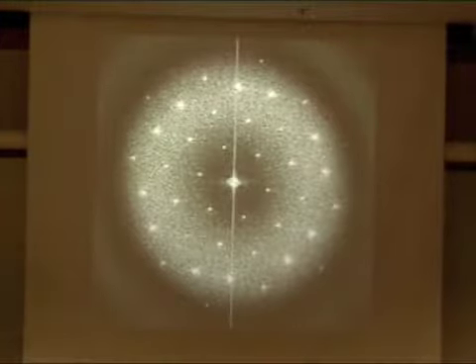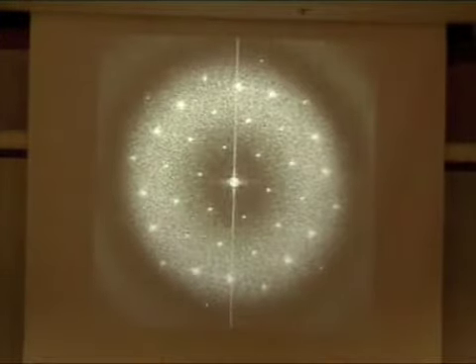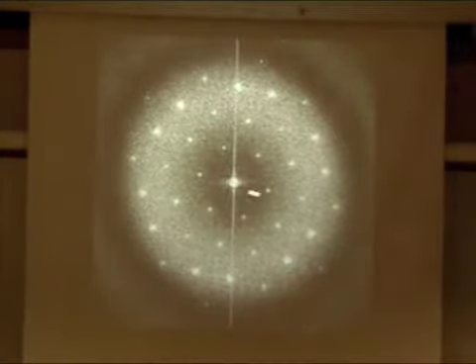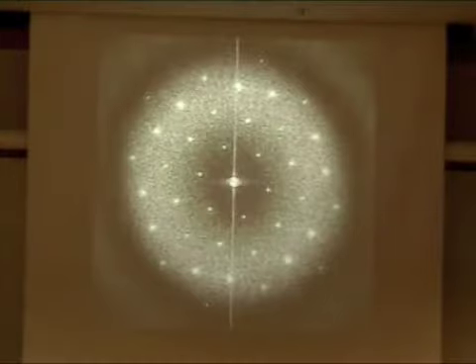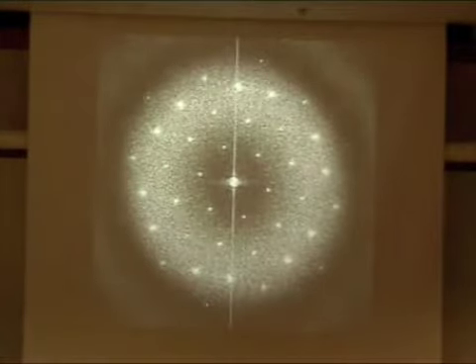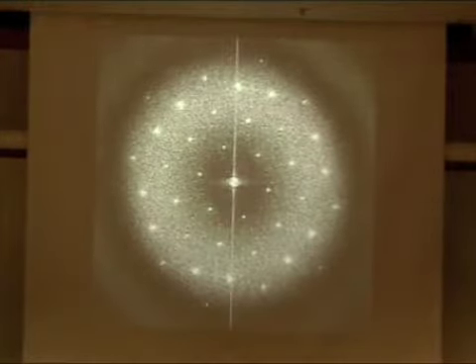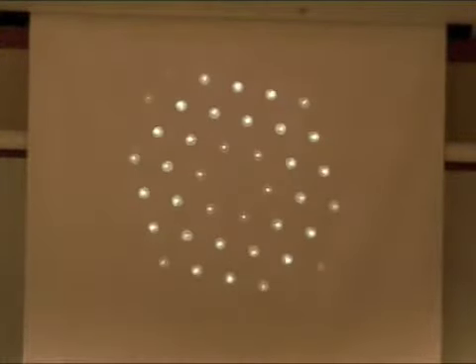Okay, so the way that we do our processing then is we find a little lattice. I know I'm going on a bit about this, but the lattice in our process is the single most important piece of information that we have, and everything is being done in deference to that, so that we can get these things very precisely. We find our lattice, we mask out just those areas that we know are both on the lattice and also actually have a spot. There are places out here that simply don't have spots because of noise or whatever. Don't bother including those. And then we inverse Fourier transform back to real space, and we get something that looks far more like our crystal.